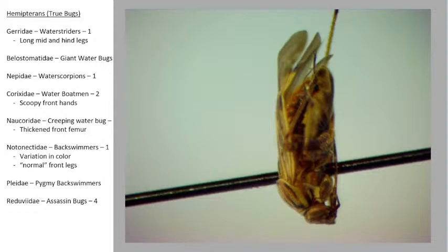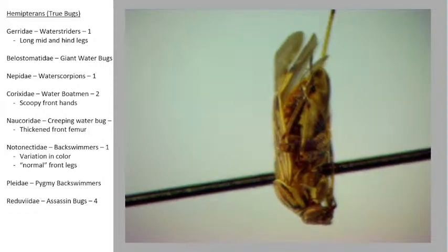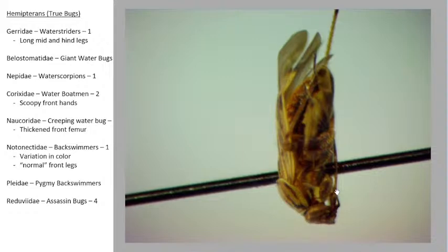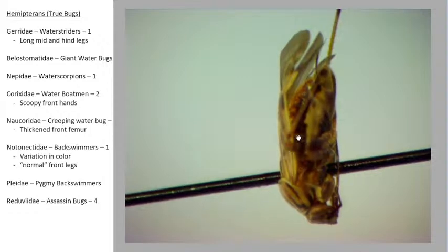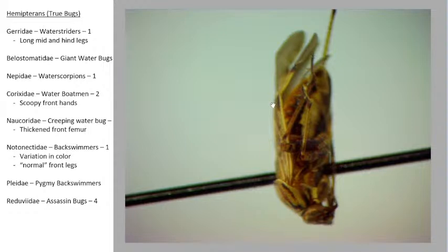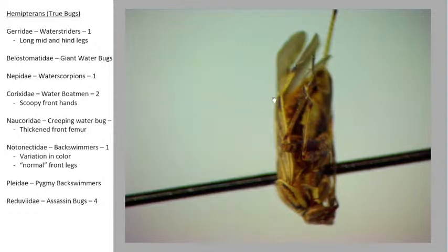Alright, so we are looking at a mirid or a plant bug here. It has this long tube-like mouth part on the bottom of its body. You know what's funny? Oh yeah, the mouth part is in front of the pin, so you can kind of see it right here. But if we look at the back, this is the characteristic that you're going to be looking for in plant bugs. You can see that the back is very much flat here, and then right here you see that there's this angle, and its wings drop drastically. Alright, and that's going to be the characteristic for most mirids.